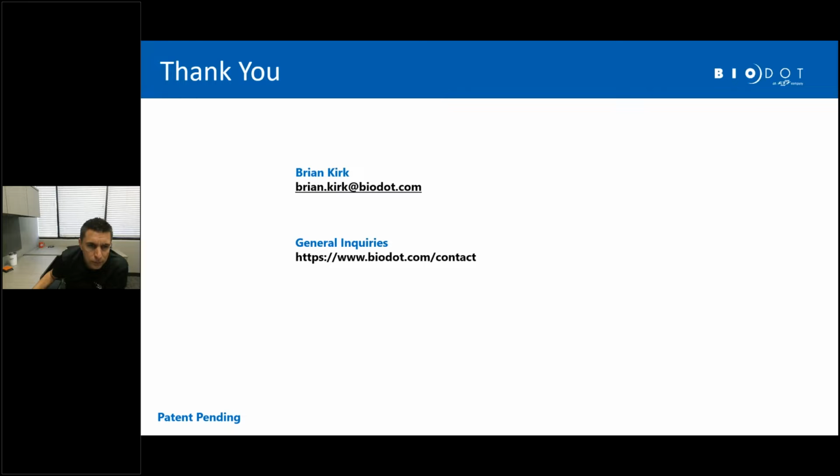So the question is that we showed the part leading to bead formation, and we mentioned partners for the rest of the workflow. The question is whether we have the entire workflow available for customers to handle lyobeads.